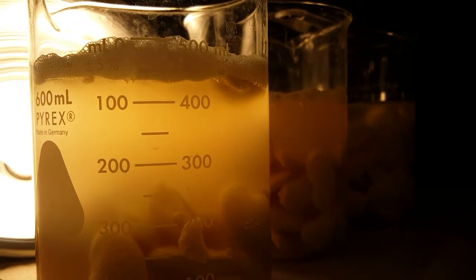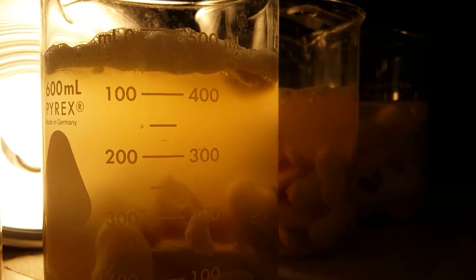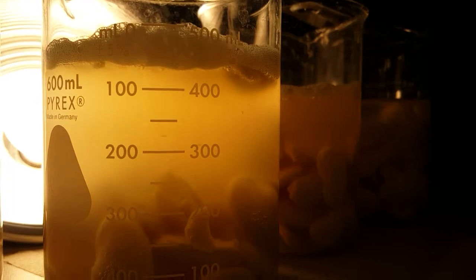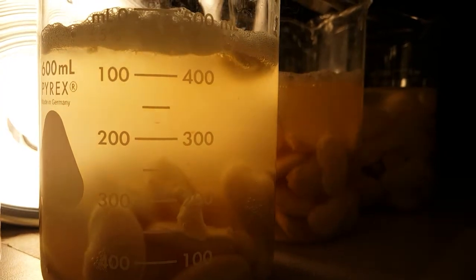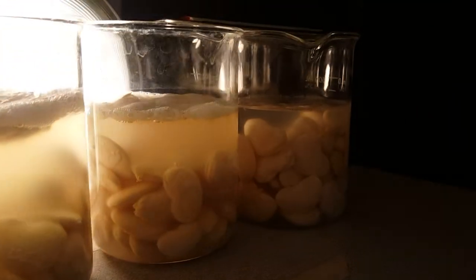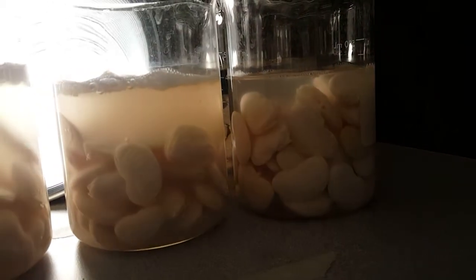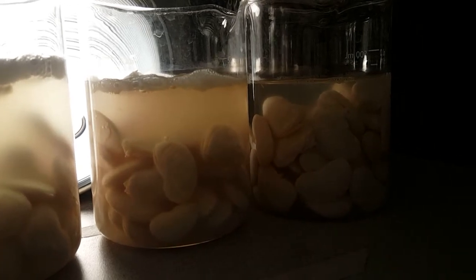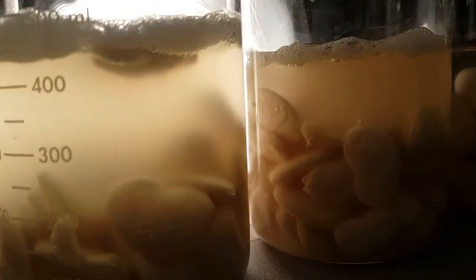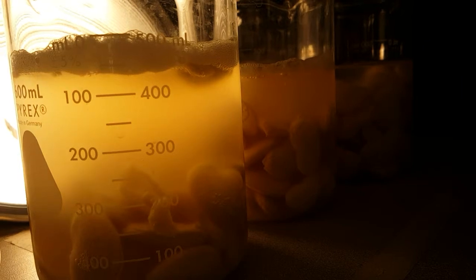Check out that cell respiration going on — you can see all those bubbles coming up. Those bacteria are consuming the lima beans as food, and each one of the cultures is at a little different state. Some are a little better than others, but they're all active. You can see bubbles in each one of them — that one has some really good action going on.